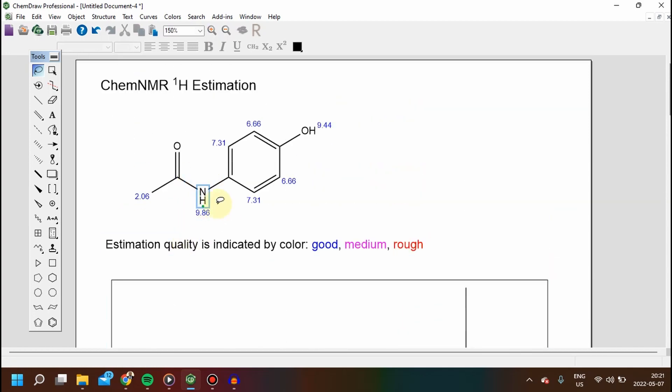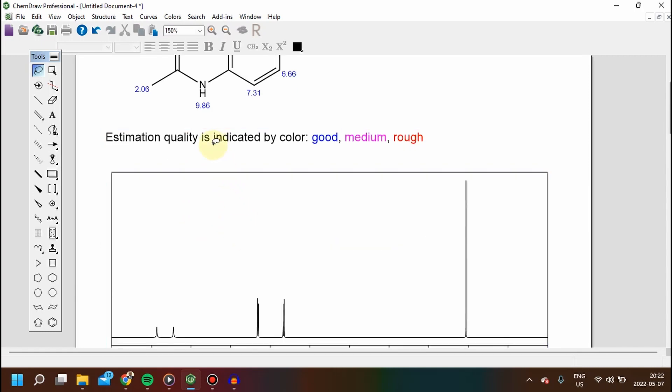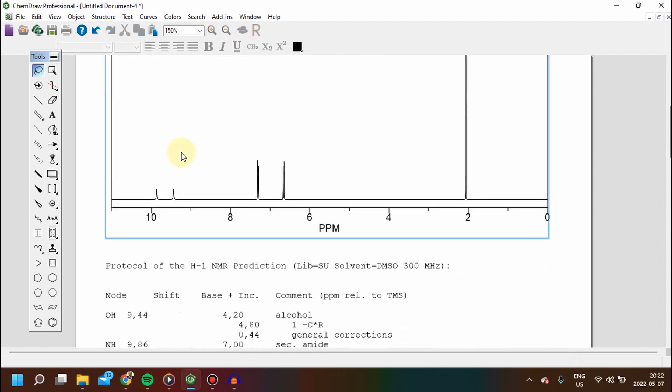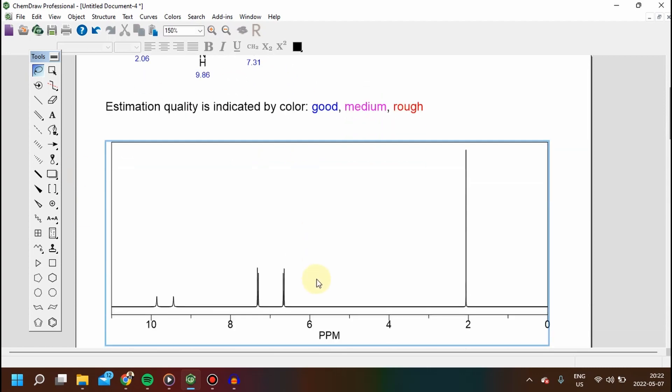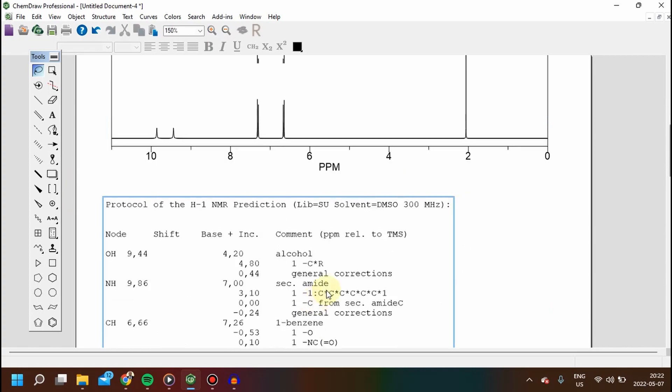Similarly, we have a proton connected to the nitrogen which is also highly deshielded. Down here we have the spectrum graphically representing the numerical data for the chemical shifts. That is it.